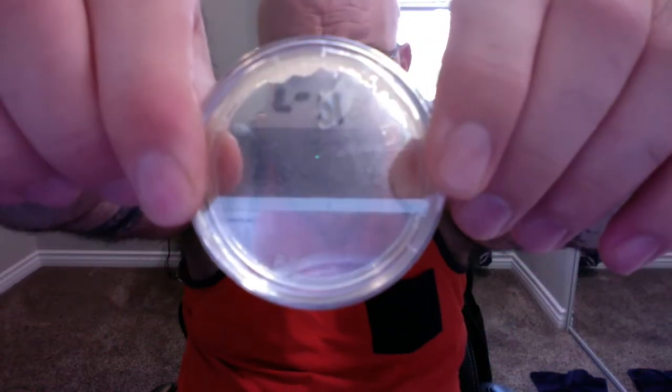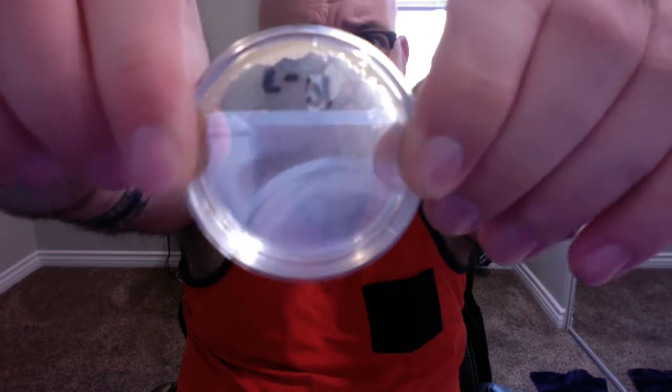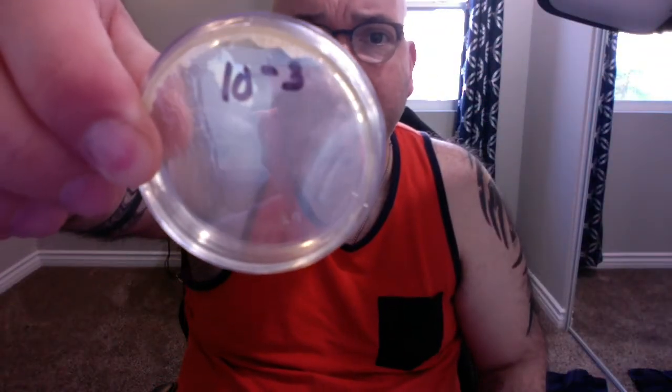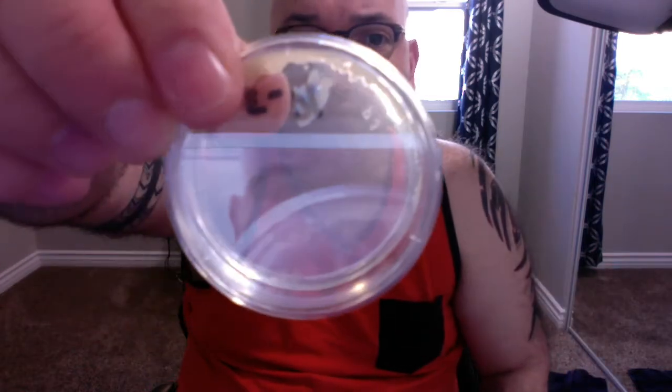So this actually might be a good viable CFU count. I'm sure there's at least 30 here, they're just all so clustered at the top of the dish and kind of behind my number 10. But this actually might be my first really good one. So that was number 3.